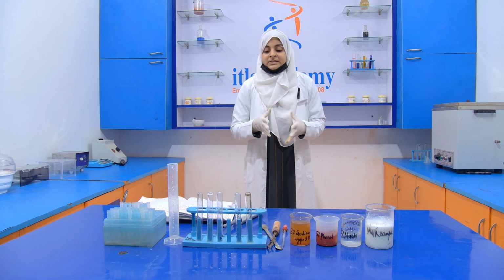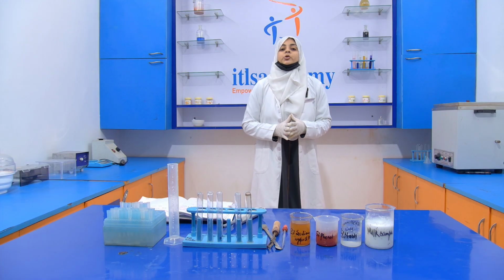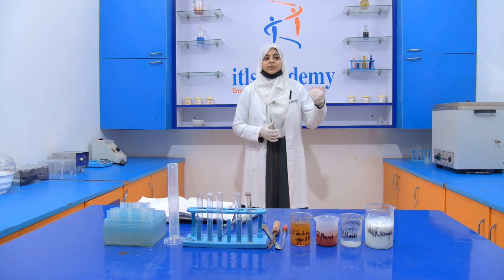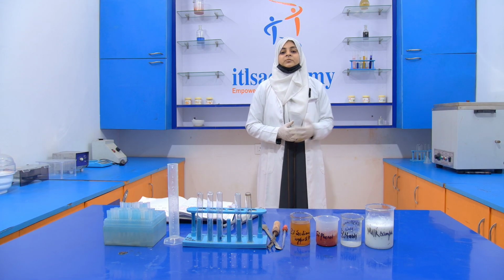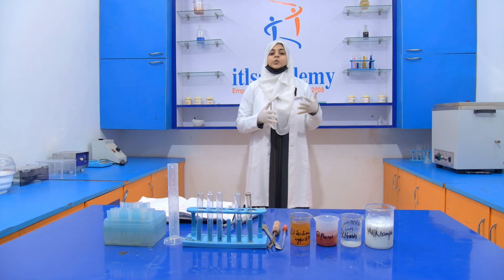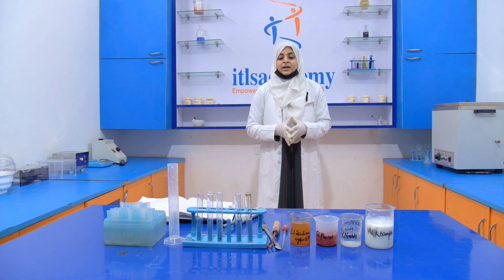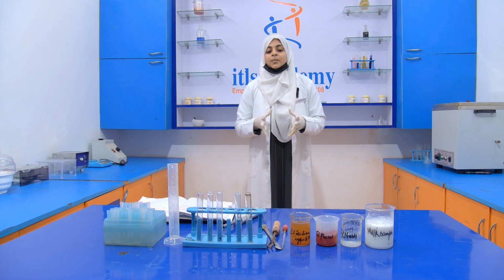But this ammonium salt does not provide any nutritional value. Even the nutritional value of the product decreases. We all know that milk provides calcium. When this ammonium salt is added, the calcium quantity decreases, and due to this, bone related problems increase. That's why it is very important to detect this ammonium salt in a milk product.